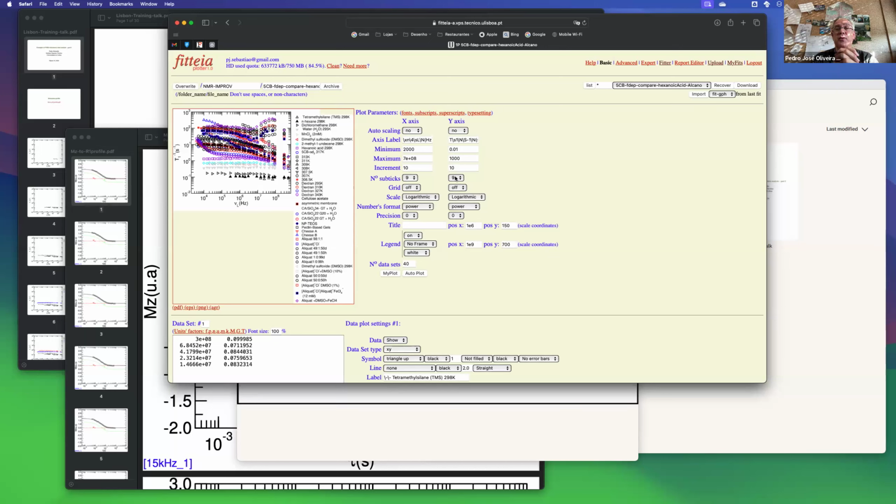It can be a rather complex system where you need much more than one exponential to explain your data. And from the point of view of discussing the relaxation rate profiles, it is a challenge indeed, because the interpretation becomes harder, or might be harder, to assign one particular component or one particular value of the relaxation.